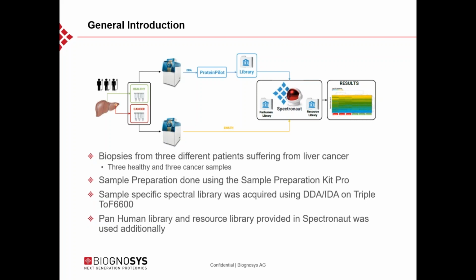And we've basically used these 2 bigger libraries to show that nowadays with the protein FDR calculation on the actual DIA data, you can also use these larger resource spectral libraries to generate meaningful data. I'll now hand over to Nick so that he can introduce the SWATH workflow and the TOF.